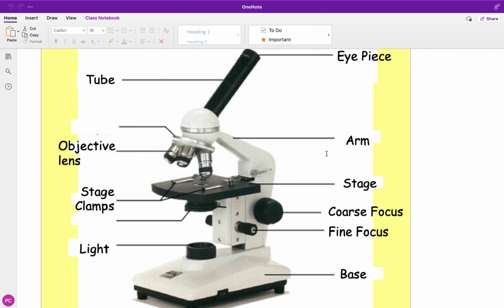This is the thing you were messing with in the senior lab last week. And the microscope, you have a couple of important parts that you were using the last day, but you probably didn't know what the names of them were. And I'll show you really quickly what they are now. So the bit you were looking into was the eyepiece. And there's a little lens inside the eyepiece that kind of magnifies whatever you're looking at.